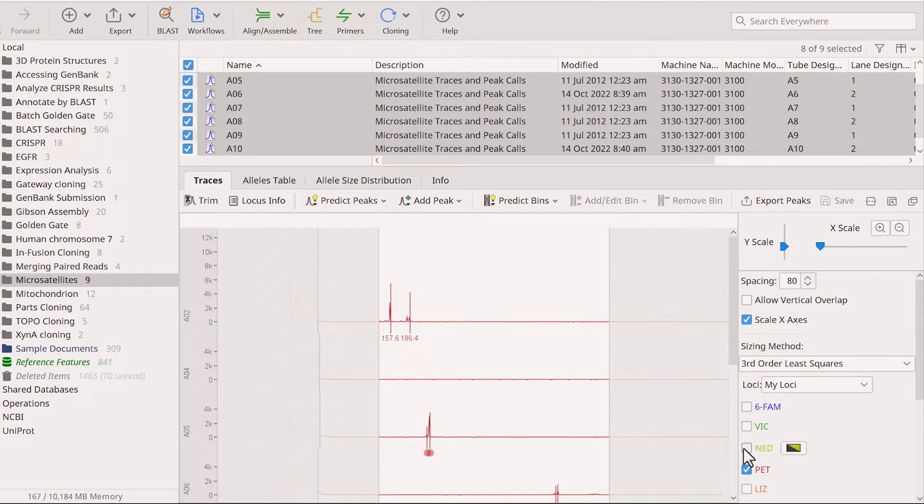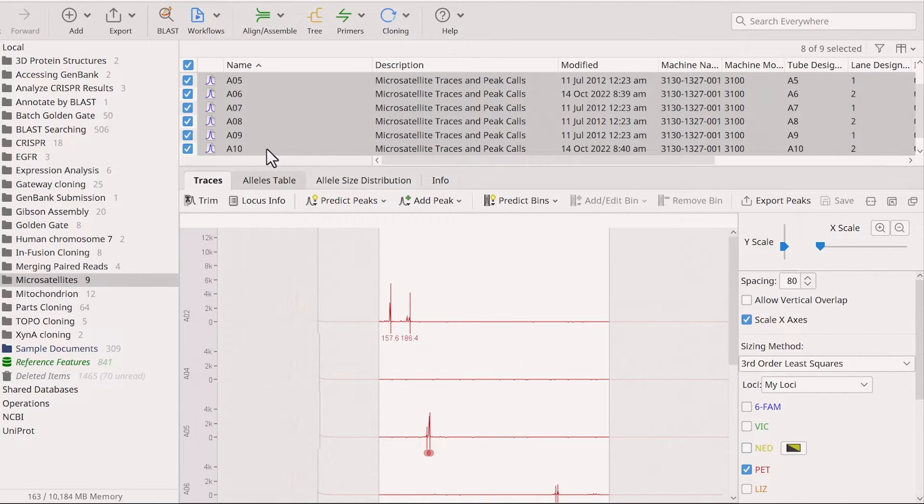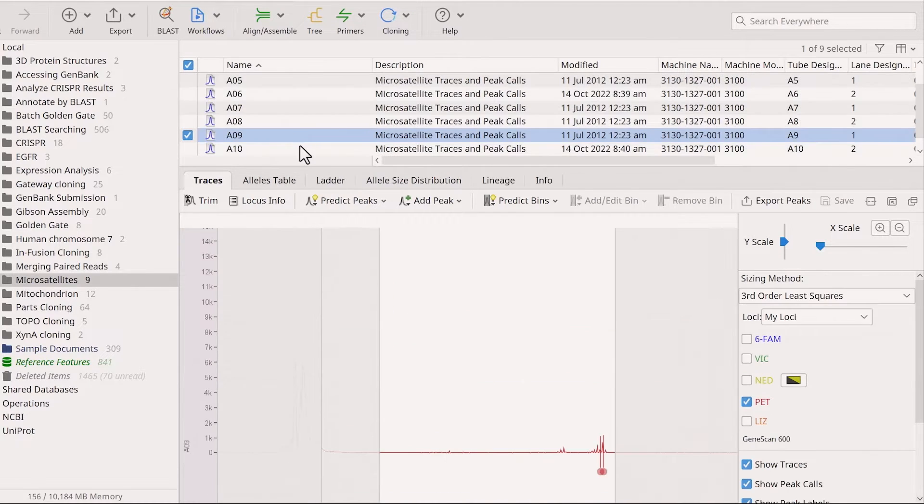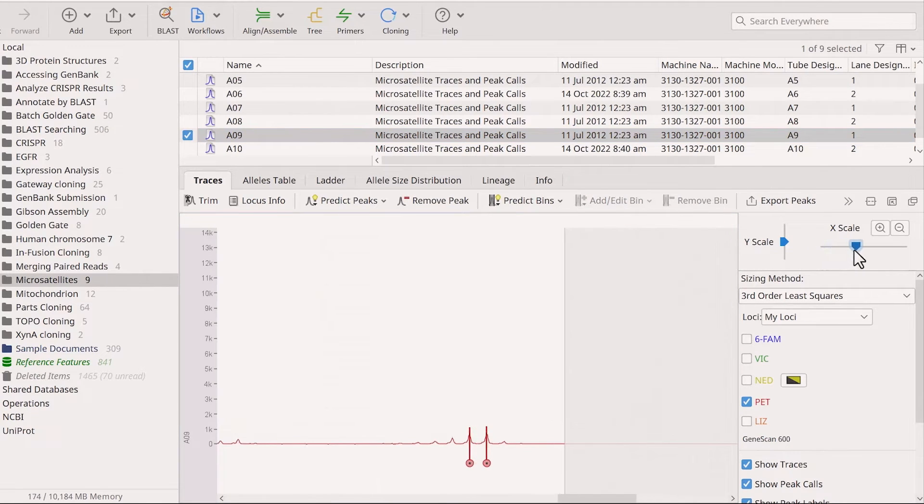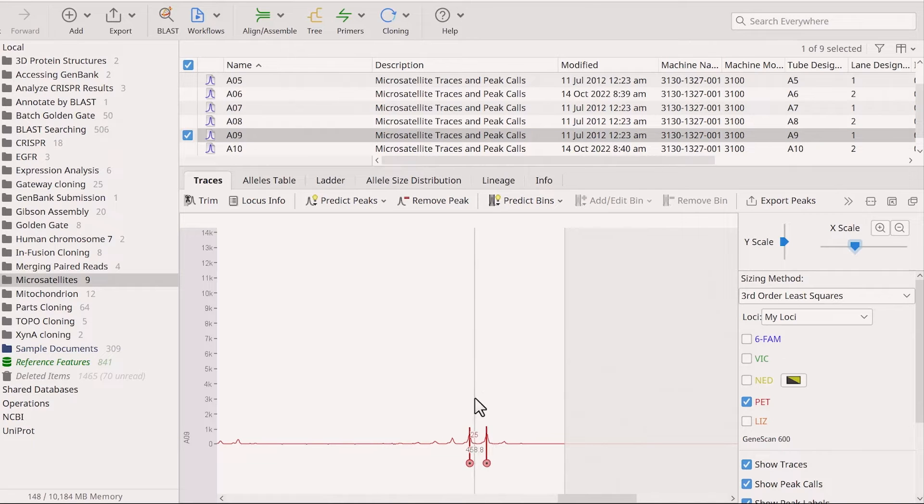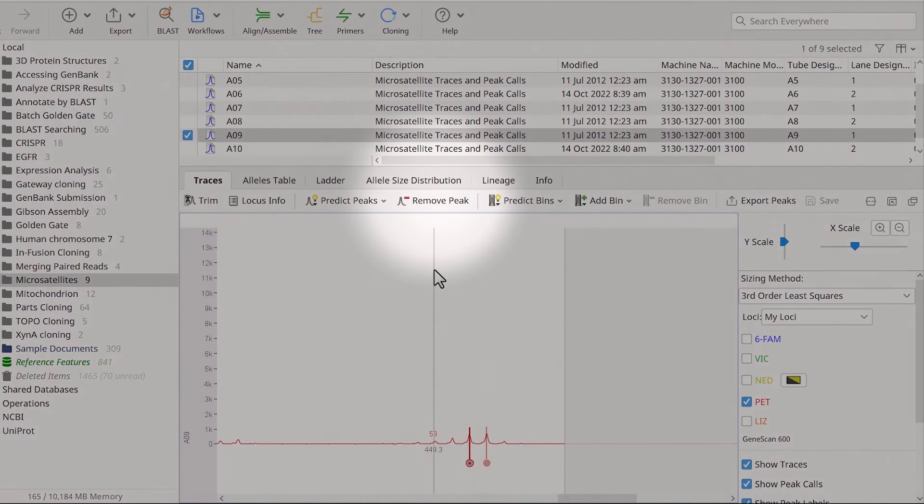For example, stutter peaks are minor peaks 1 to 4 repeat units away from the actual peak. To remove an incorrectly called stutter peak, select it and either press Delete or use Remove Peak.